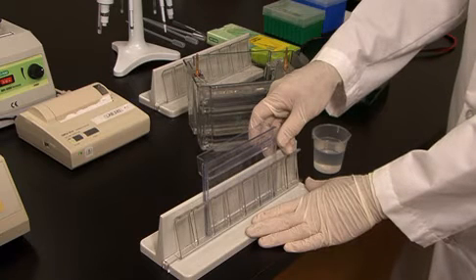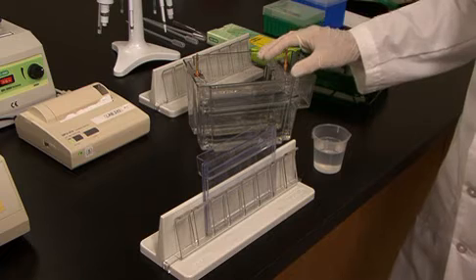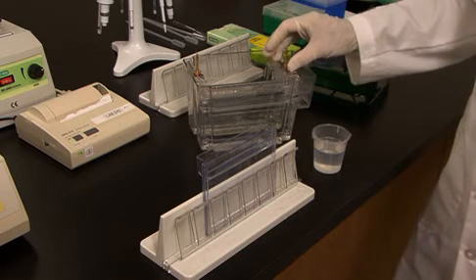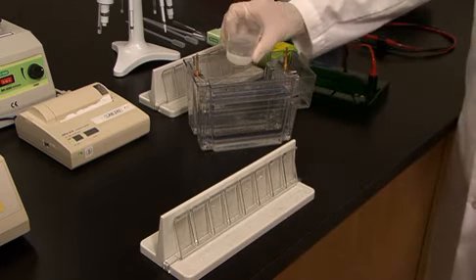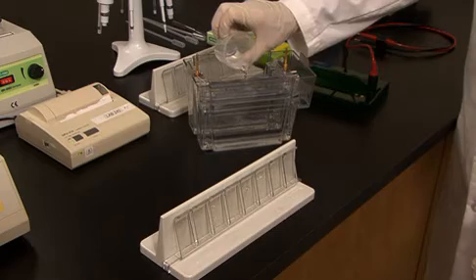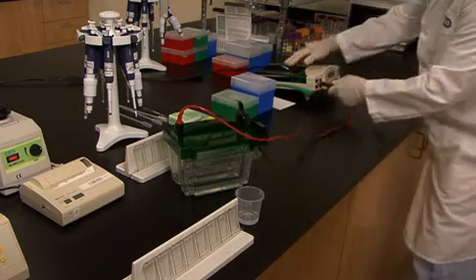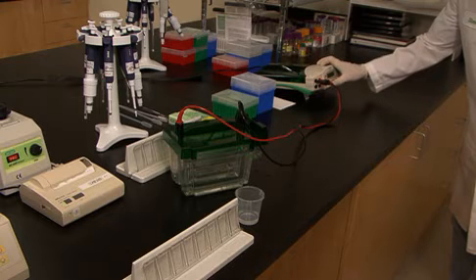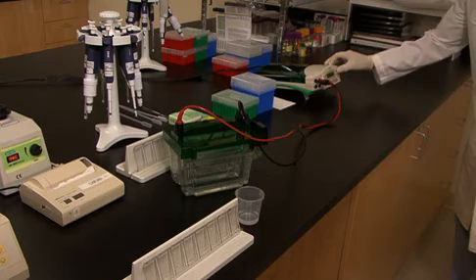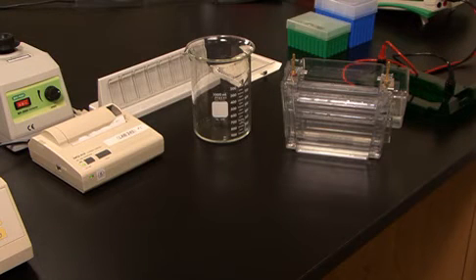Now that the agarose is solidified, I'm ready to run the gel. In this case, I'm going to run the gel in the Criterion gel box, which holds two gels. In most cases, you're going to run multiple gels, and you'll want to use a Criterion Dodeca cell. Remove the gel cassette and place it into the Criterion cell. Load the upper buffer chamber with running buffer. Place the lid onto the Criterion cell. Insert the leads into your PowerPak power supply. Program for 200 volts for one hour, constant voltage, and start.